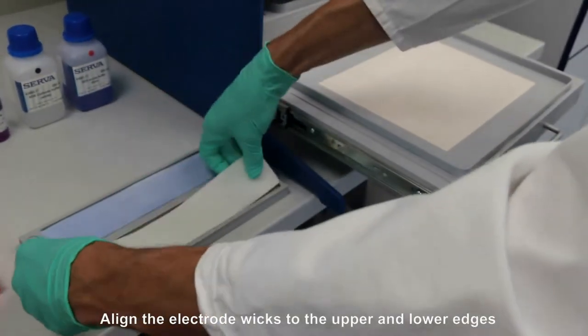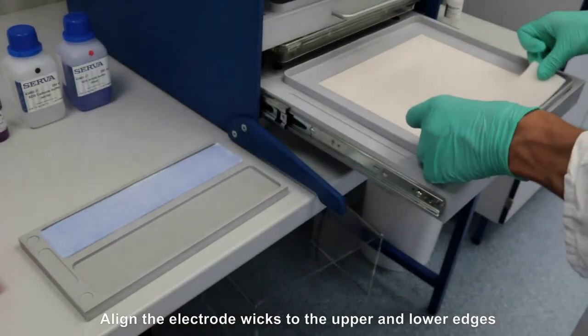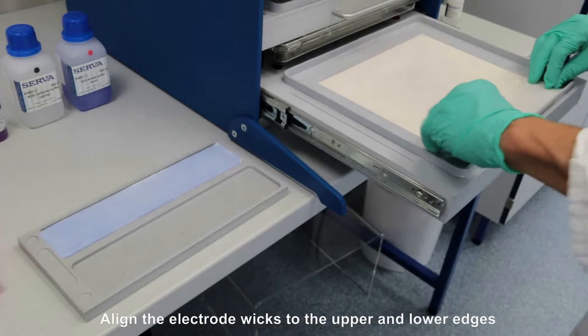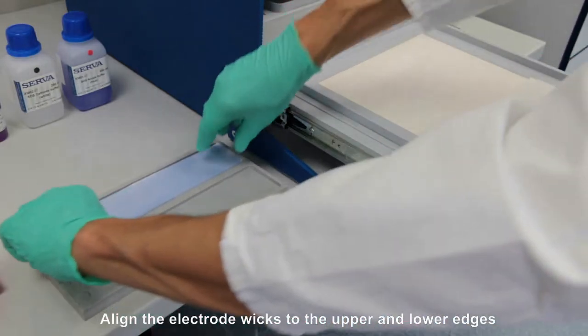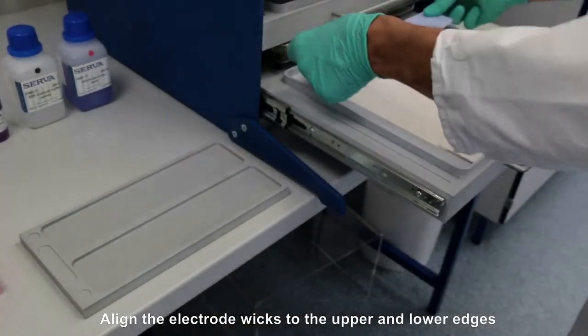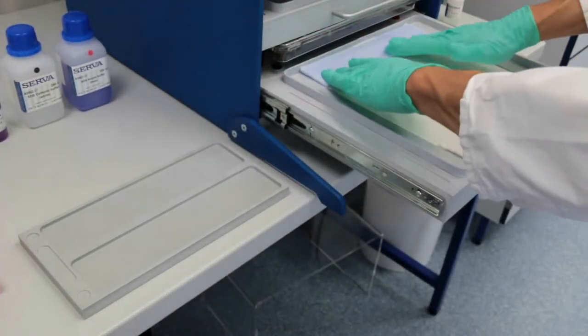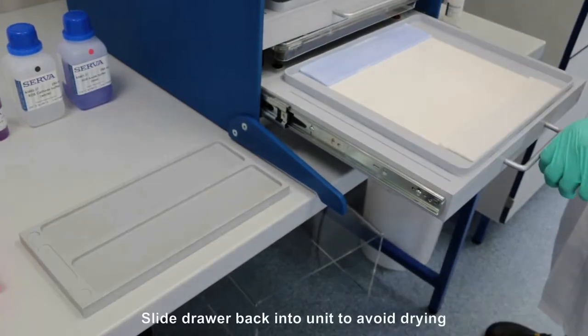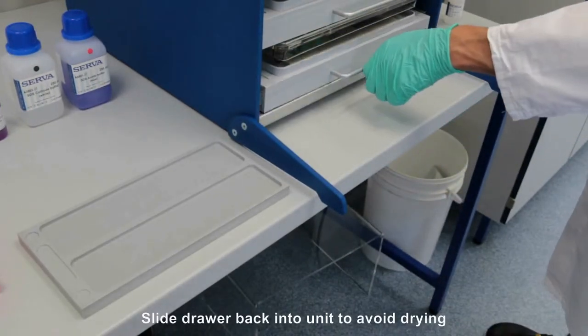Align the electrode wicks to the drawer's upper and lower edges. The wicks will overlap the gel by approximately 2mm. Slide the drawer back into the unit to avoid drying.